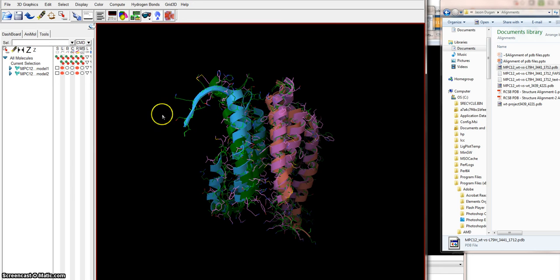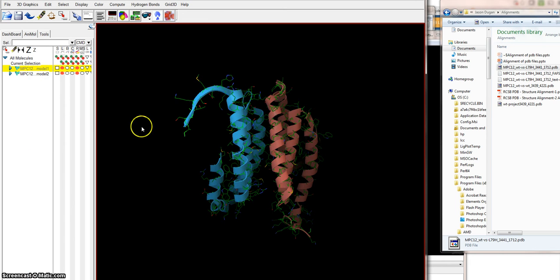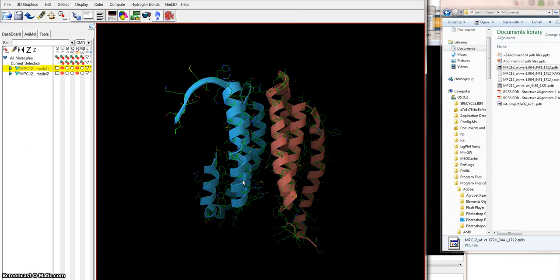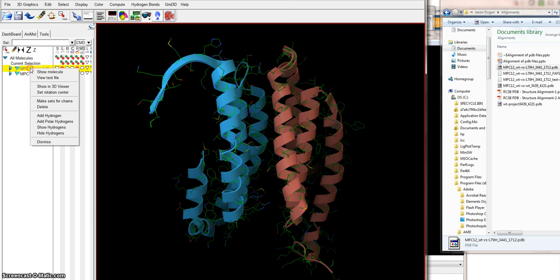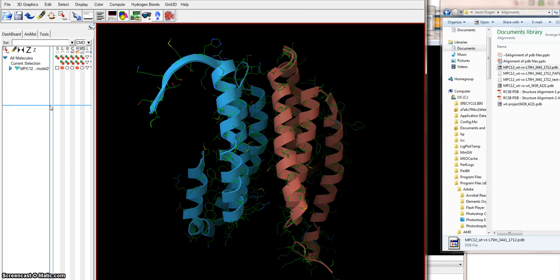And then it's possible to come over here and you can hide these. You can also delete one. I think that was the wild type that I just deleted. You'd have to go in and check. I'm running out of recording time, so I'm not double checking, but you can delete one.